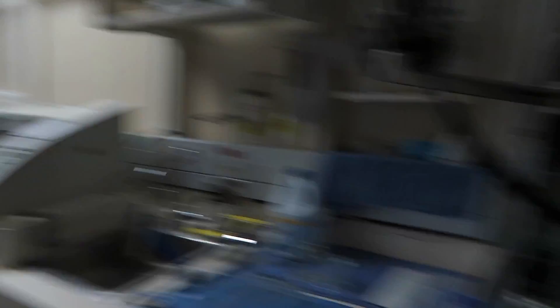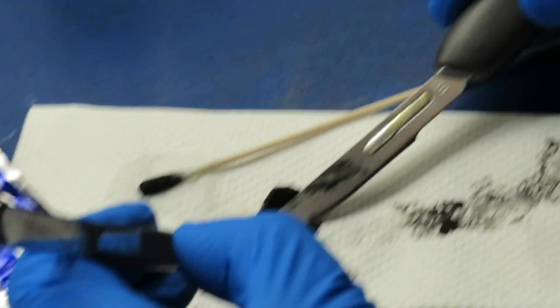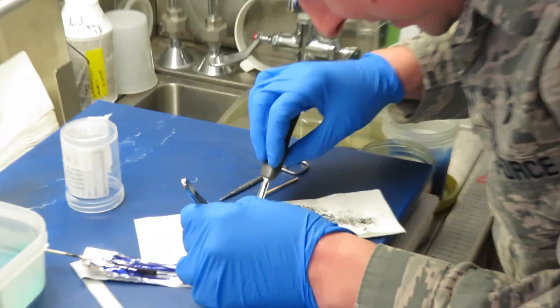Do you want another block? Yeah, we may do a second block. We get one section per centimeter of the specimen. This specimen is 2.1 centimeters in greatest dimension, so we need at least two sections — we just got one. We're going back and putting two more representative sections.